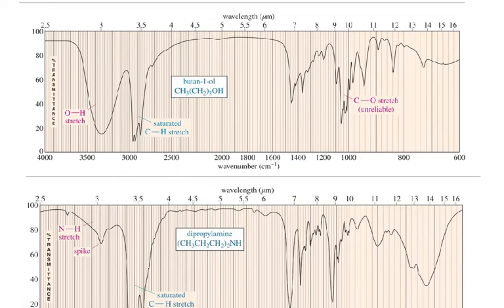But this whole right side of the spectrum is called the fingerprint region. That whole area up to about 1400 is called the fingerprint region because, say I'm taking the spectrum of, I don't know, ethane. I'm just picking a random chemical. If I already have a spectrum of ethane from a different sample, those regions are going to look exactly the same, and I can compare them and say, yeah, that's ethane.